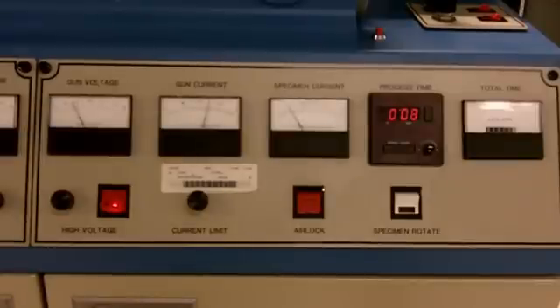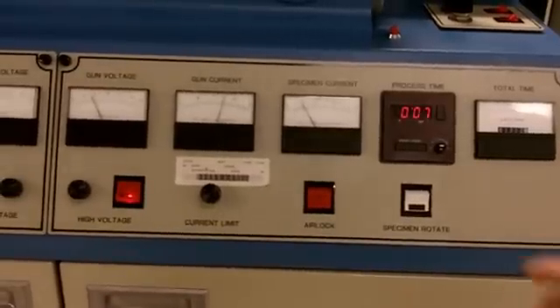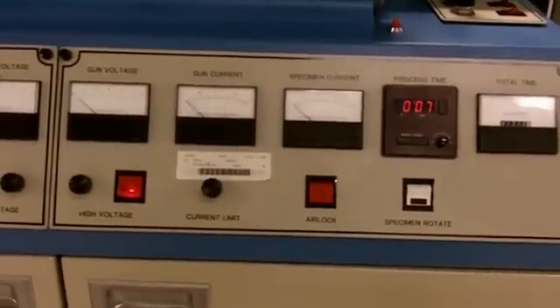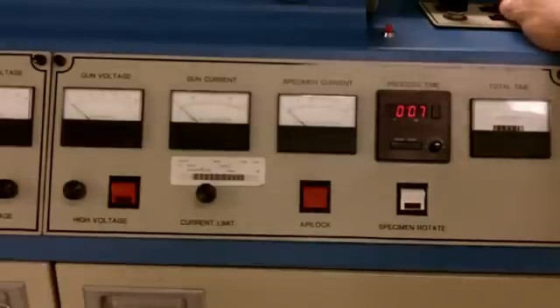As shown by our instrument panel on the right-hand side, the gun voltage, gun current, and specimen current are steady. The process time, as indicated by the little blinking light, is counting down. At any time, if we wish, we can stop it by pressing stop — notice the currents have now gone to zero. If you feel you need to end your process at this time, you should turn off the high voltage and the gas power supply switches.